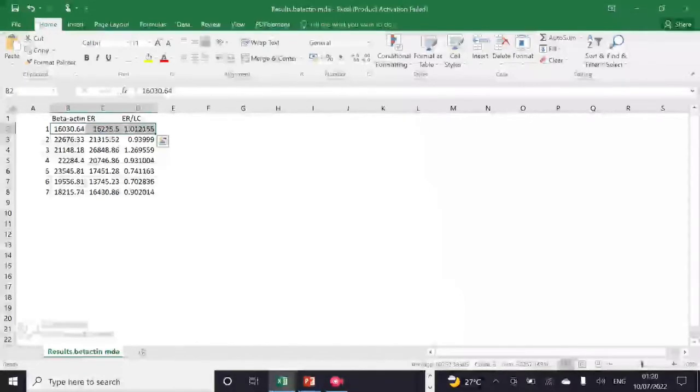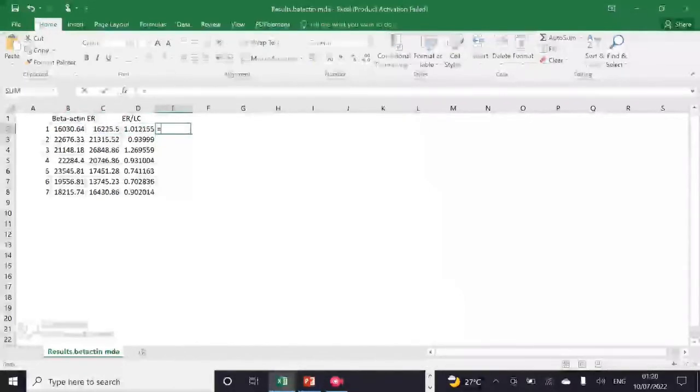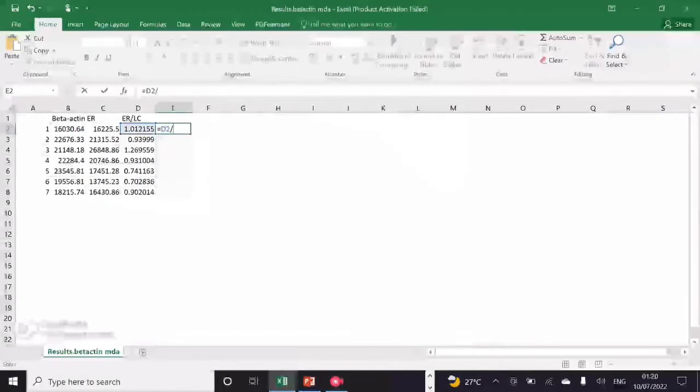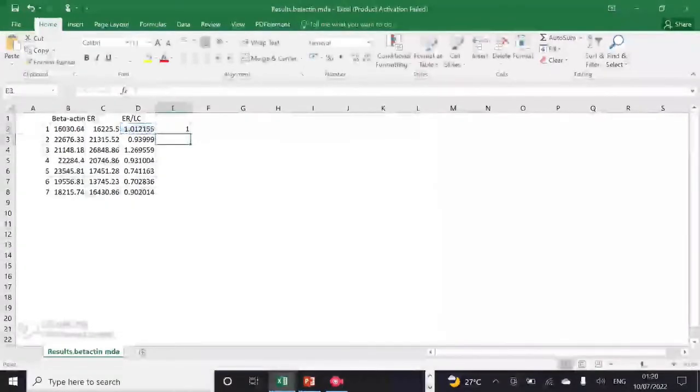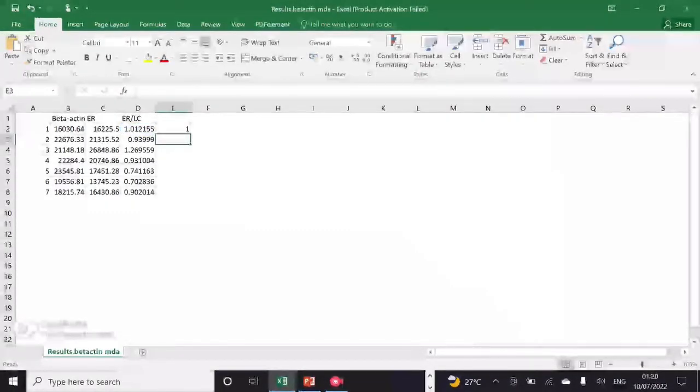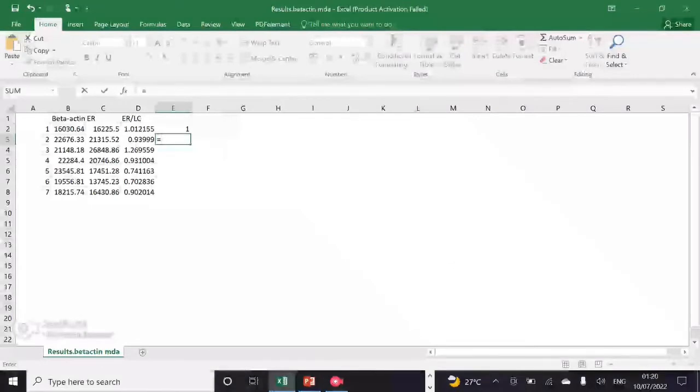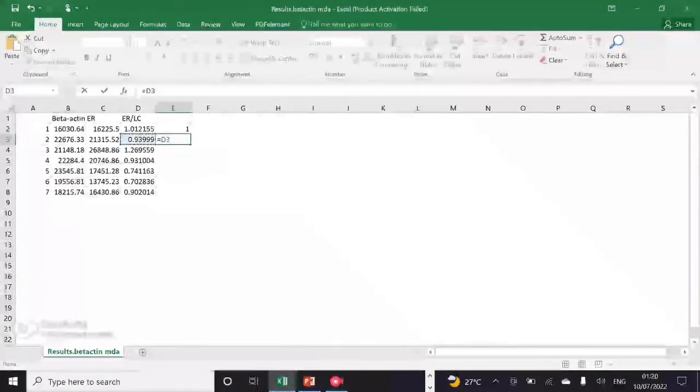After this, you can see I have seven groups: the first group is a control group and the rest of six groups are treatment groups. Now I have to divide each value with the control group further.